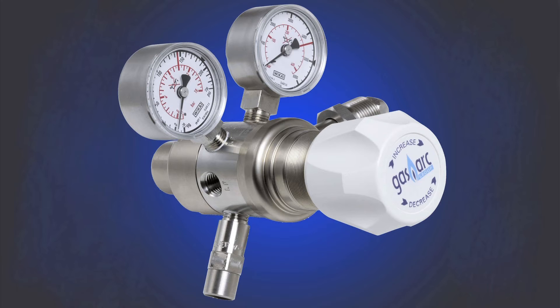The Chem Master regulators are stainless steel and are suited for the most aggressive applications, including all corrosive and toxic gas mixtures including ammonia, chlorine, HCN, HCL and phosphine, with purity grade up to 6.0 also.